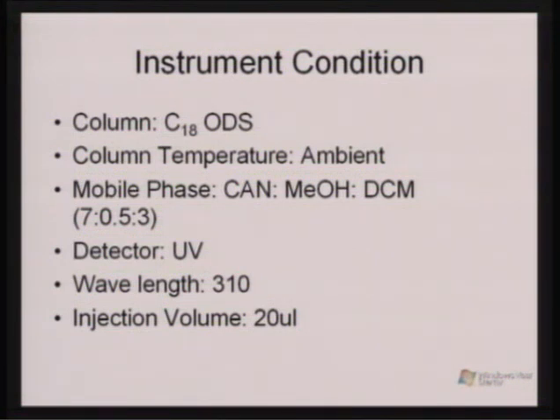For that, you need the peak area of the sample divided by the peak area of the standard, multiplied by the standard concentration, divided by the sample weight, multiplied by the injection volume of the sample and divided by the injection volume of the standard, then multiplied by the purity of the standard you have used, and again the potency of the standard. So, I have completed the chemical analysis of food and quality assurance part today.